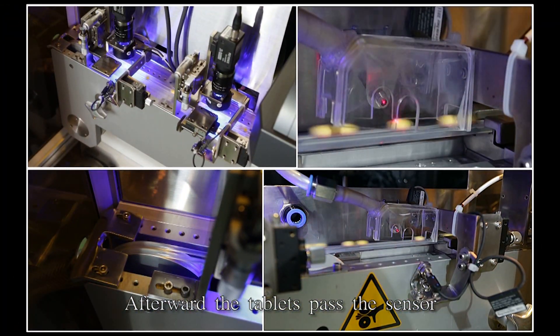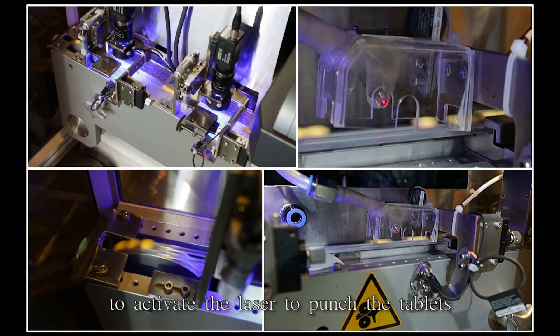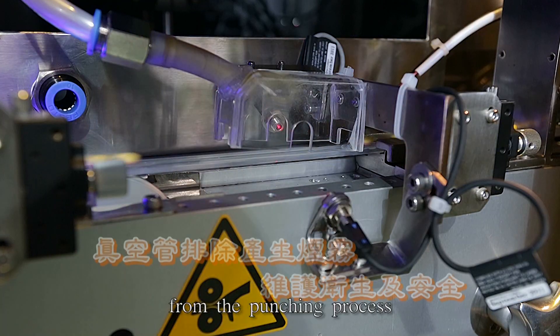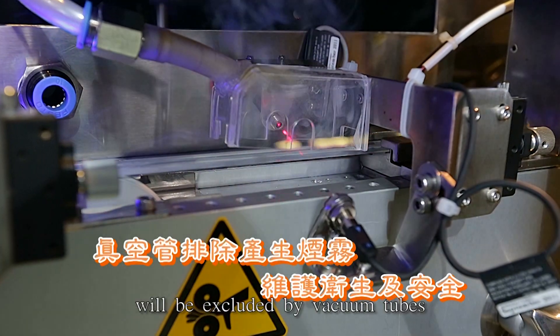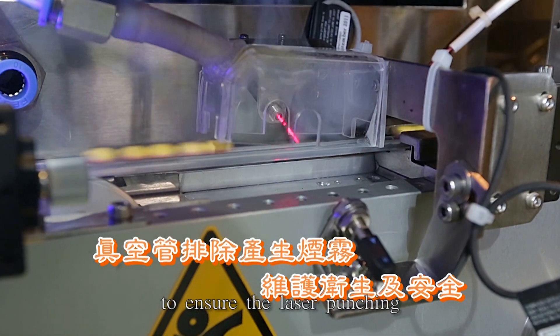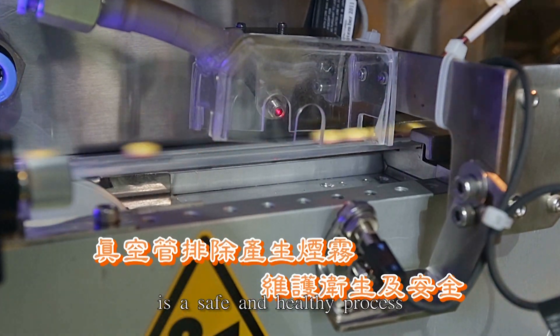Afterward, the tablets pass the sensor to activate the laser to punch the tablets. The residue and smoke from the punching process are excluded by vacuum tubes to ensure the laser punching is a safe and healthy process.